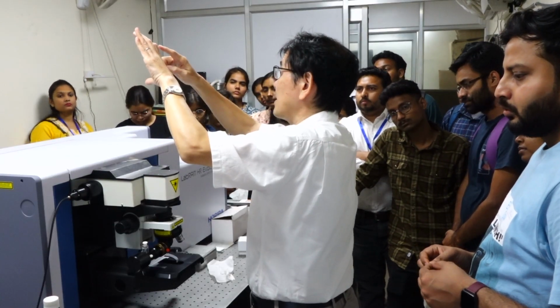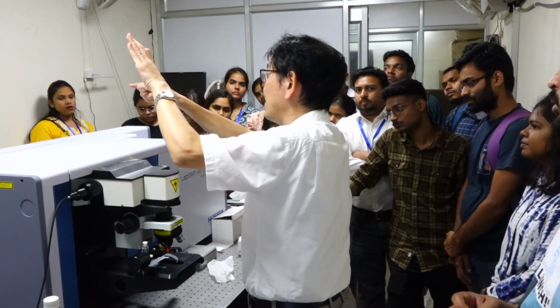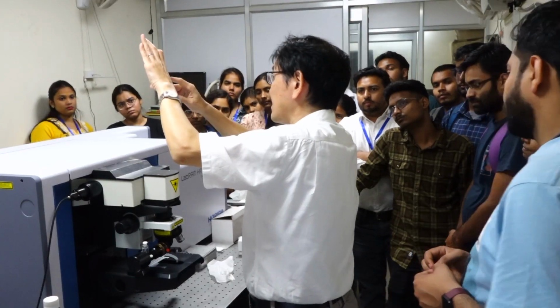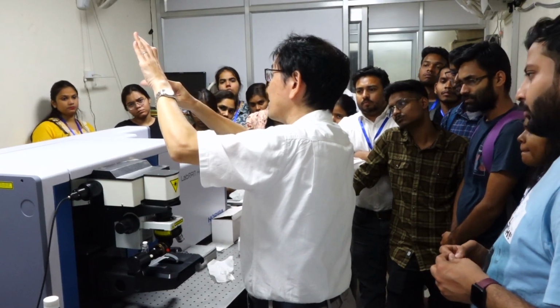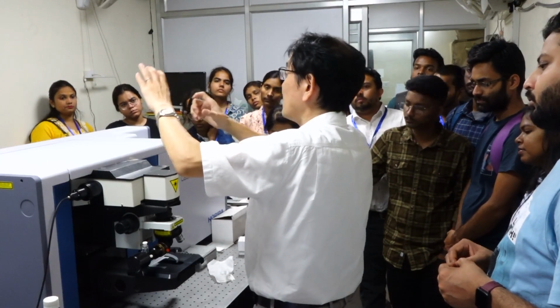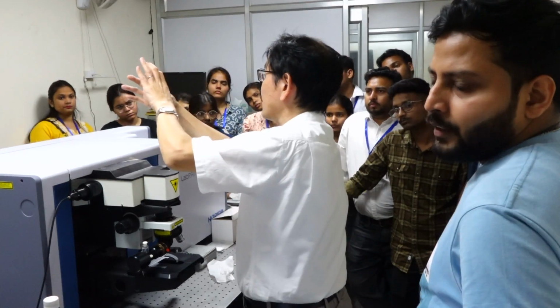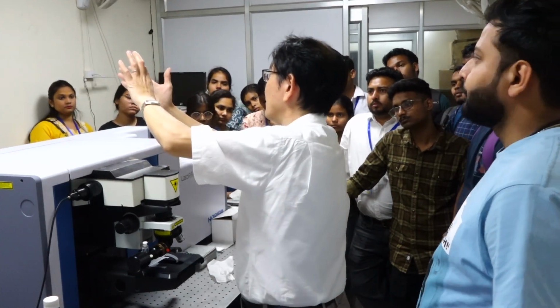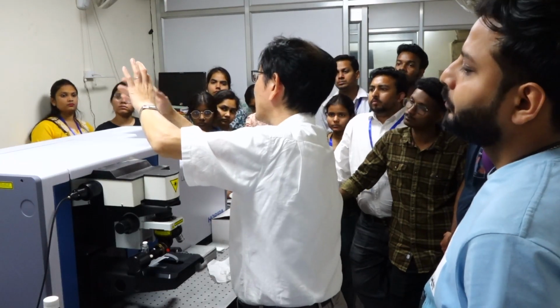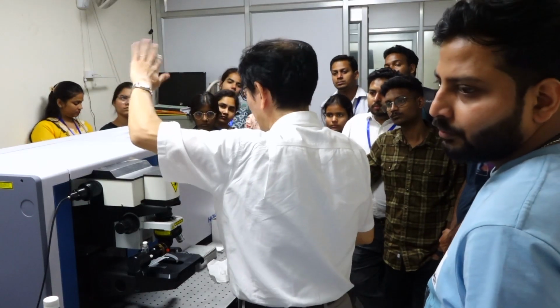Then transmittance is 100, 100, 100, 100, and suddenly becomes 0, 0, 0, 0. Then reflectance is accordingly 0, 0, 0, 0, and suddenly 100%. So the center is a cut-off wavelength. So this element is transparent below cut-off wavelength and serves as a mirror above cut-off wavelength. Then let's put this element here.